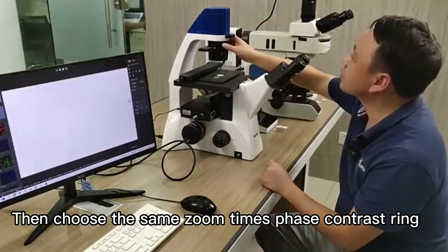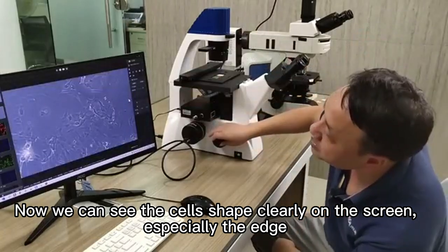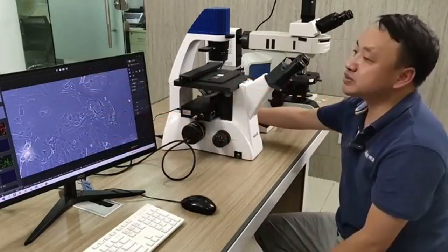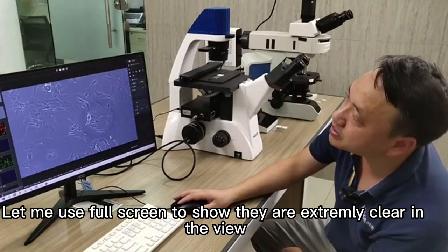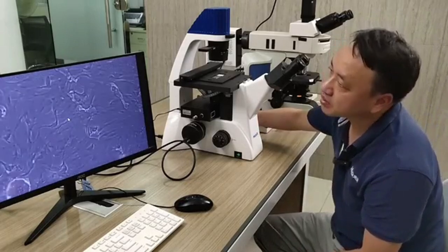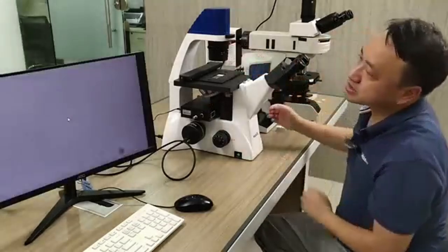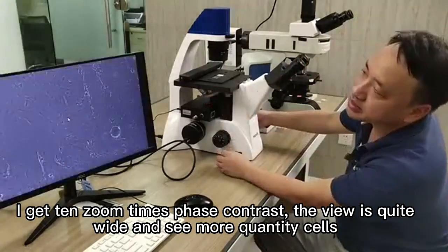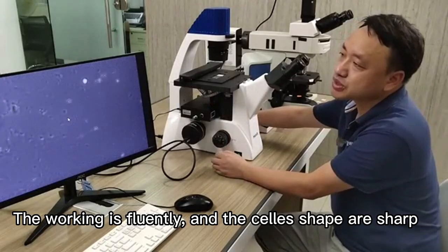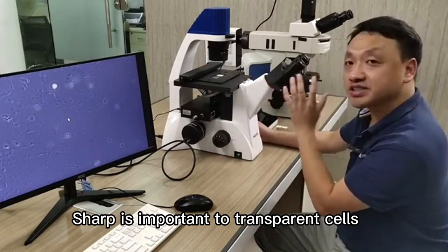I select the 20x phase contrast objective, then choose the same zoom times phase contrast ring. Now we can see the cell shapes clearly on the screen, especially the edges. It is still clear when moving the slide. Changing to a 10x phase contrast objective gives a wider field of view to see more cells. The working is smooth and the cell shapes are sharp.